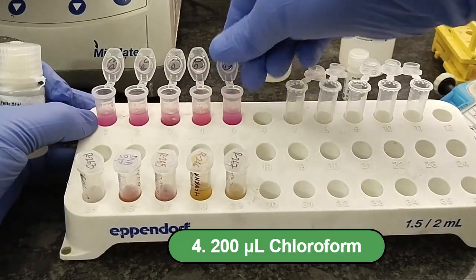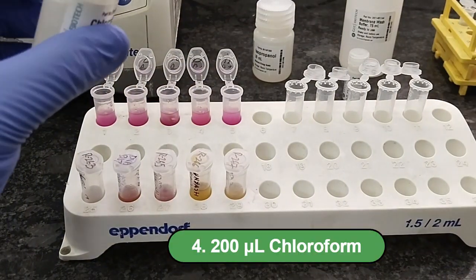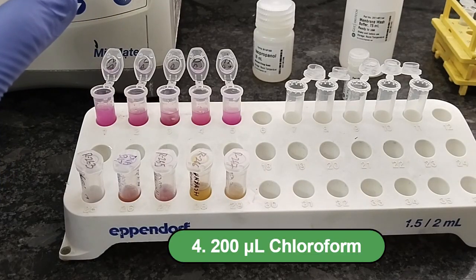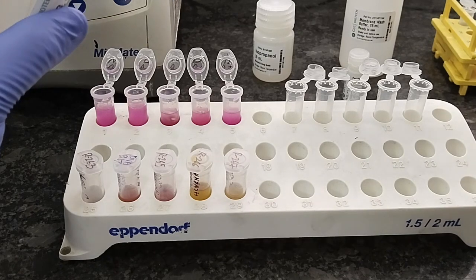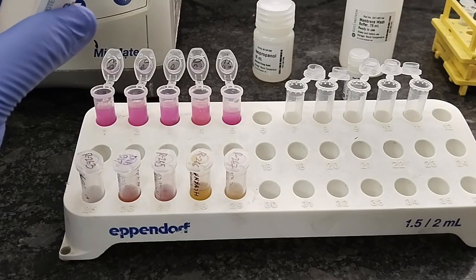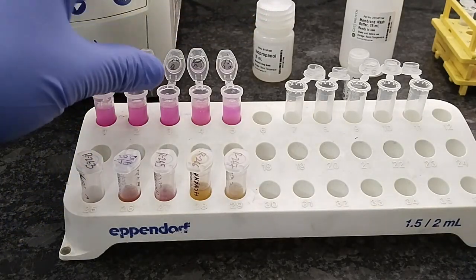It is an anesthetic agent, so you have to be very careful at the time of addition of chloroform. Chloroform addition is done, then close the lid very tightly.